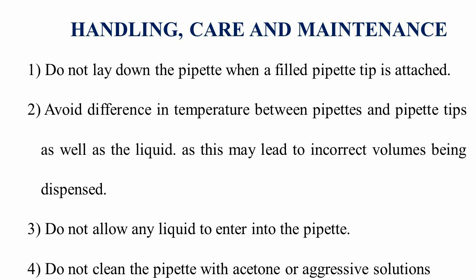Handling, care and maintenance. 1. Do not lay down the pipette when a filled pipette tip is attached. 2. Avoid difference in temperature between pipettes and pipette tips as well as the liquid, as this may lead to incorrect volumes being dispensed. 3. Do not allow any liquid to enter into the pipette. 4. Do not clean the pipette with acetone or aggressive solutions.